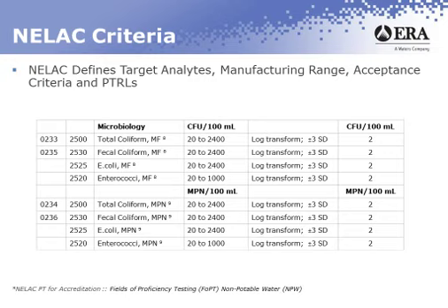So to add a little bit more clarification to that, if you were running method 9222B for total coliforms by membrane filtration, you'd be reporting the result as total coliform MF. If you were doing 9222D, fecal coliform by membrane filtration, it would be reported as fecal coliform MF.